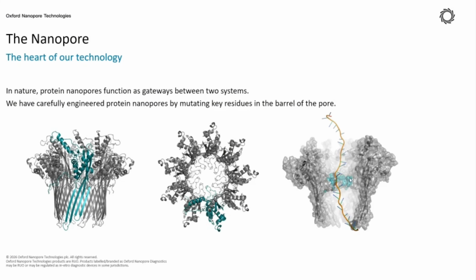And because this process is controlled by the ONT device in real time, that also means we are able to control it if the nanopore is capturing DNA molecules that are off target, not within our target regions. This process is called adaptive sampling.